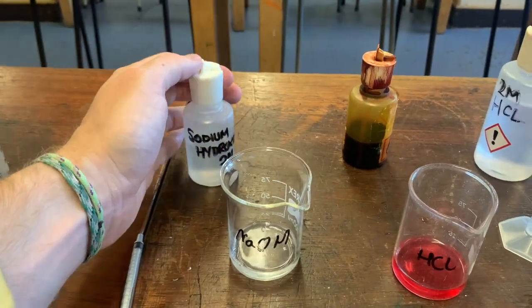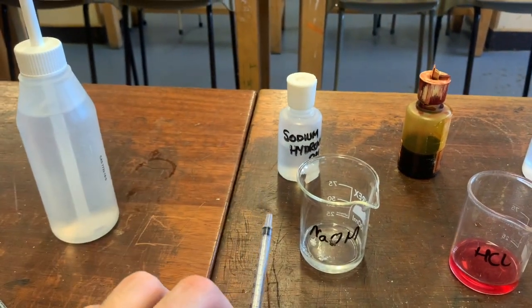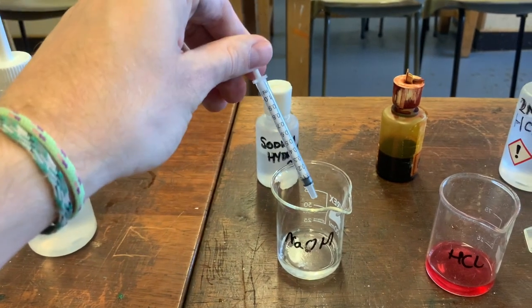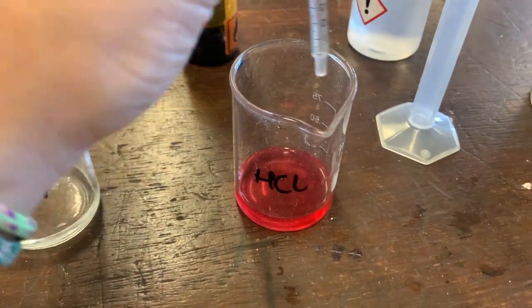I'm going to decant some sodium hydroxide into here — I don't need very much as I'm only going to be using 10 milliliters throughout the whole experiment. Then we want to use the syringe to suck up just one milliliter of this solution. Let's add in the sodium hydroxide.